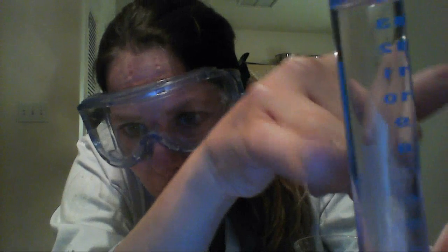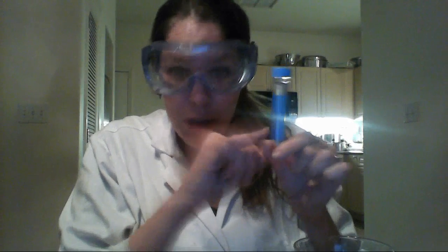It's really hard to film things in a camera. Okay, anyway, just take my word for it. My DNA is floating right here. You'll see it on yours. Big clump of spider webby, whitish looking goo.